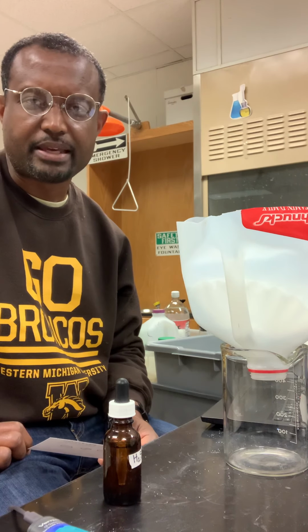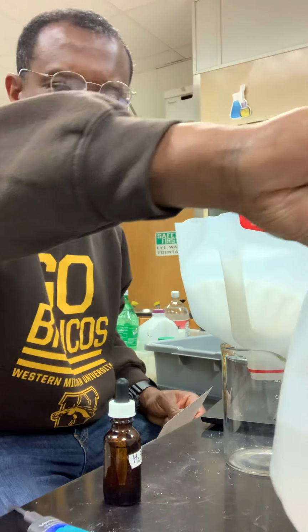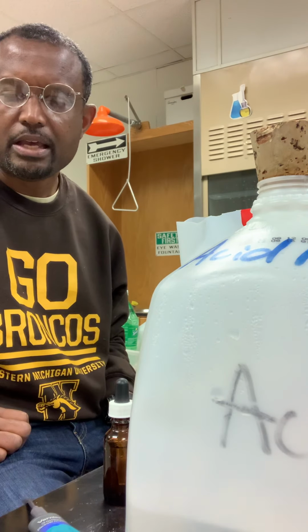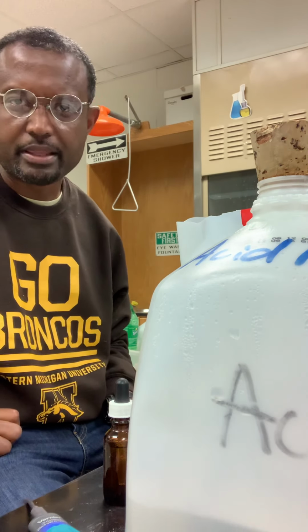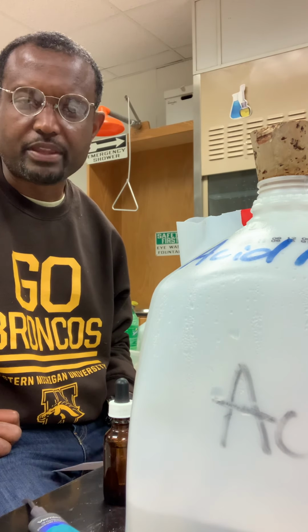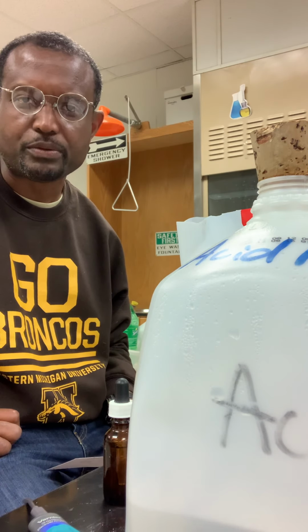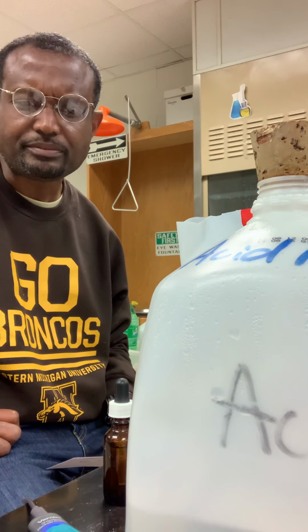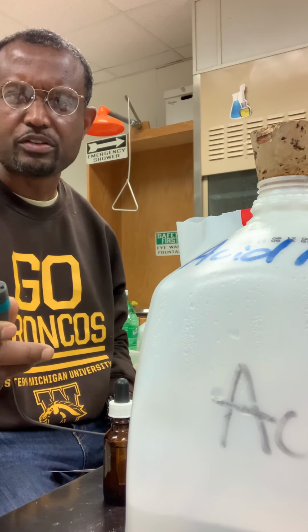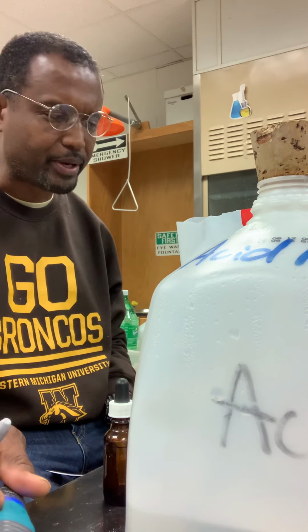So in this investigation, it's quite simple. We're going to be using some nitric acid. And by the way, nitric acid is produced when nitrogen dioxide gas reacts with oxygen and water in the atmosphere to produce nitric acid. It is one of the acid rain forming gases that produce this nitric acid. And so we'll test the initial pH of the acid, and it is recorded in the data as 1.89.